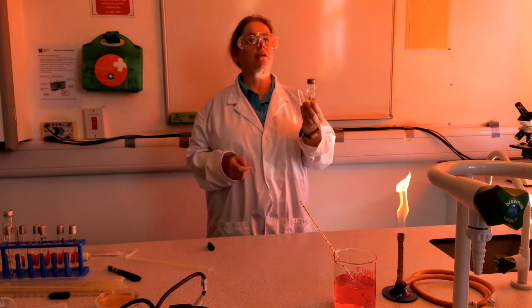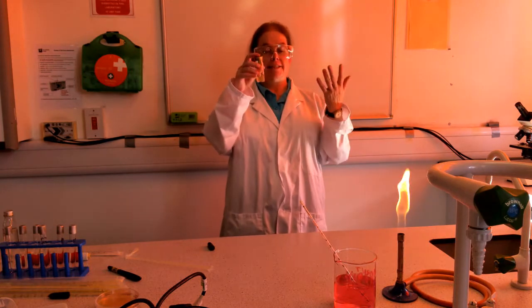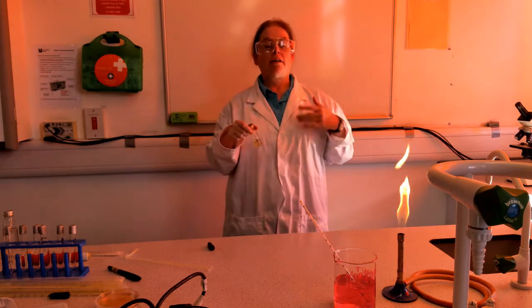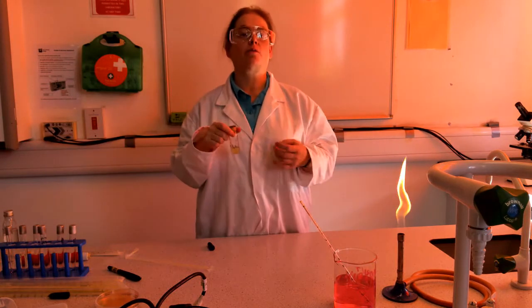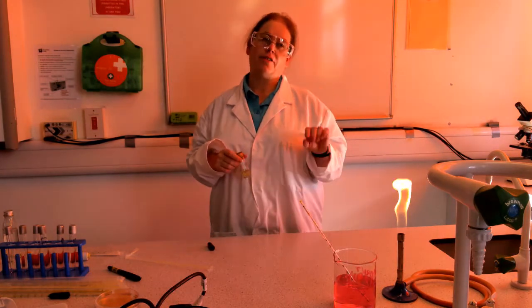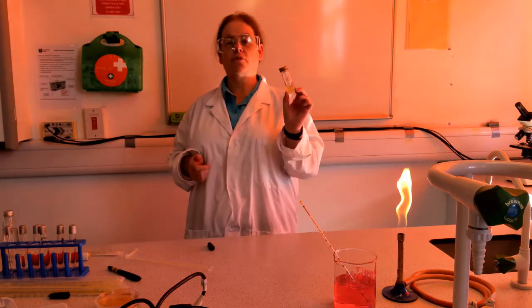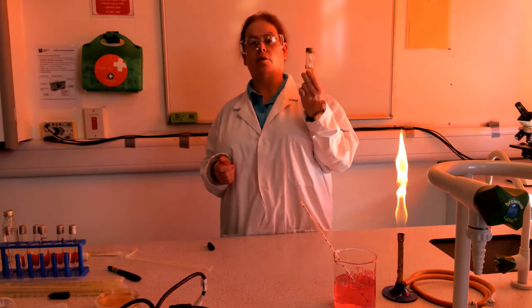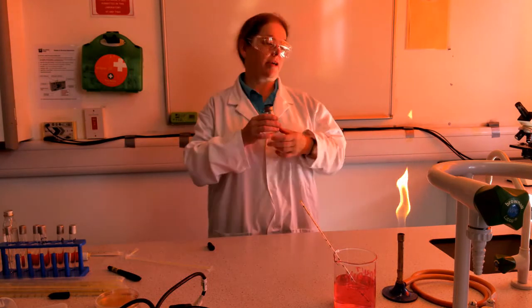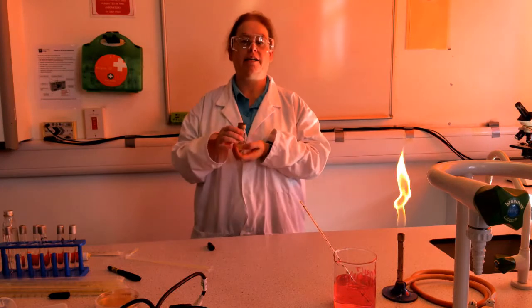Here is the bottle that I just inoculated, which has been incubated and has now grown a fair number of bacteria. Now, what we have to do now is count how many bacteria. There are 4 different methods that are sometimes used, and I'm sure there are more somewhere in a textbook, but there are 4 standard methods for finding out how many bacteria per millilitre there are in this bottle, so that we can compare it to the number of bacteria that have grown in the other growth media.